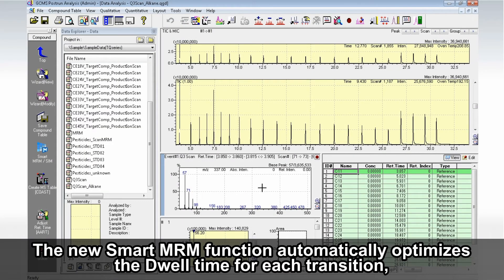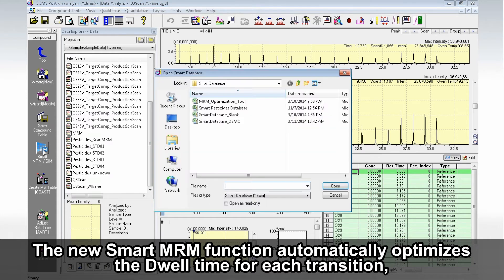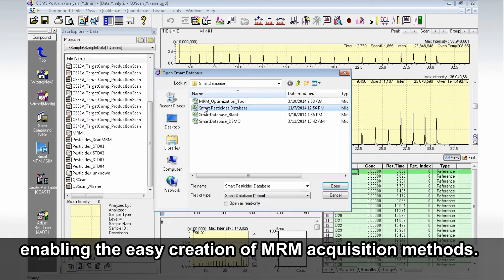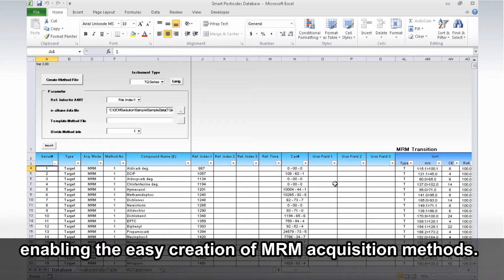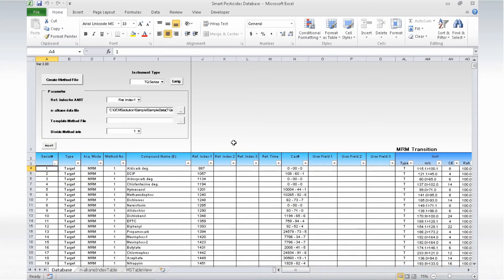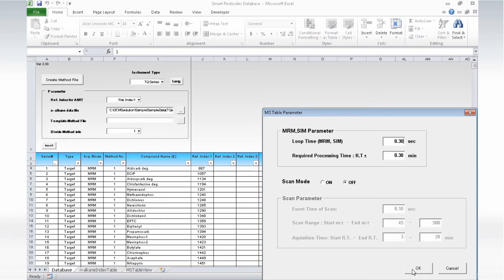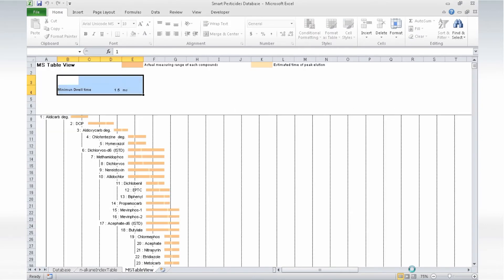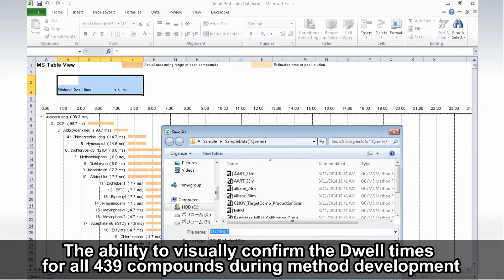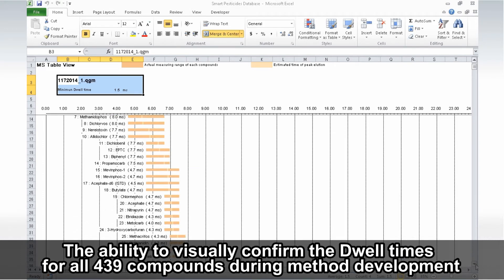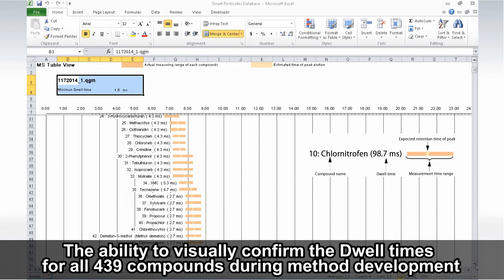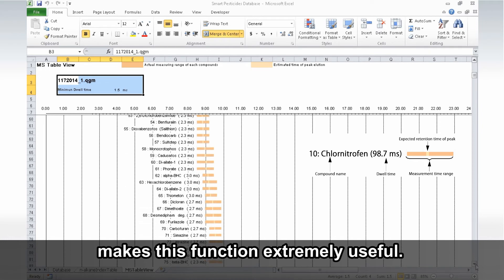The new SMART MRM function automatically optimizes the dwell time for each transition, enabling the easy creation of MRM acquisition methods. The ability to visually confirm the dwell times for all 439 compounds during method development makes this function extremely useful.